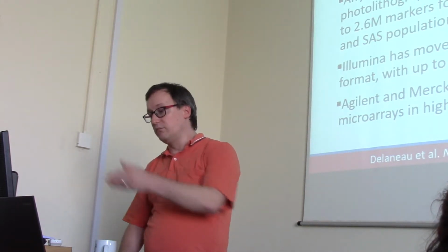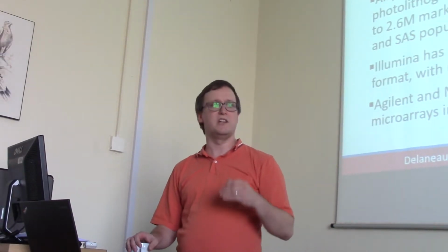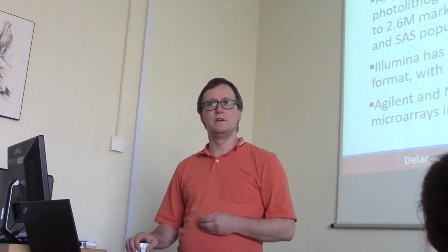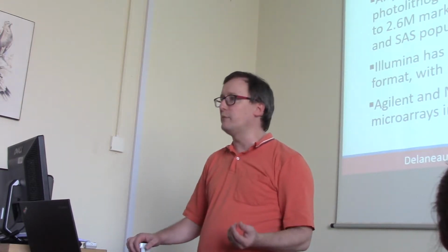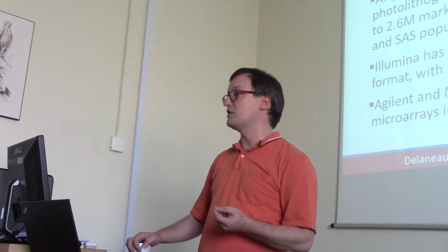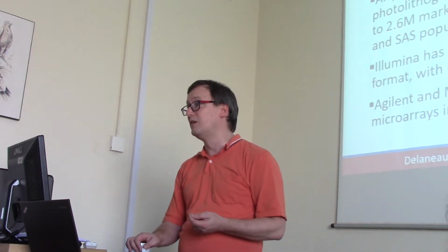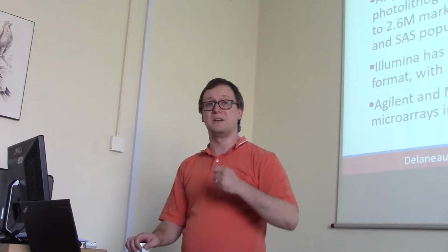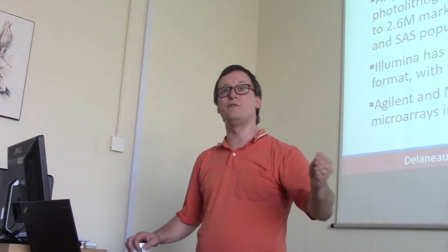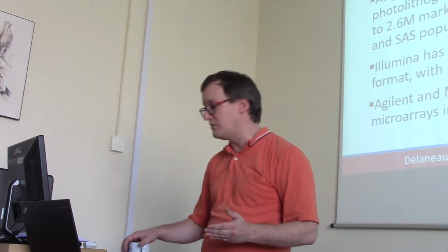So I did a quick look at this last year to ask how many different companies are still in the business of microarrays. From the perspective of the bioinformatics community, you might be justified in thinking that microarrays aren't even sold anymore, but in fact they're doing quite a lot of good business now. The reason being that people sometimes just want to measure known variations across very large numbers of people, and that's a whole lot easier to do with a microarray.